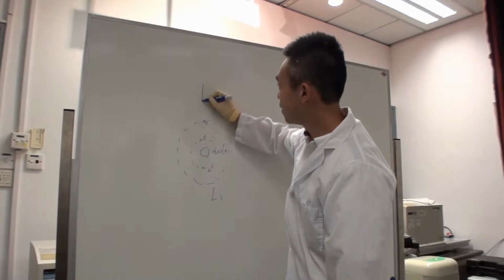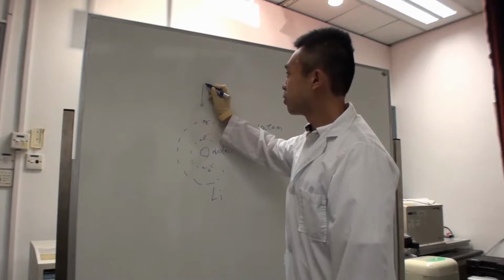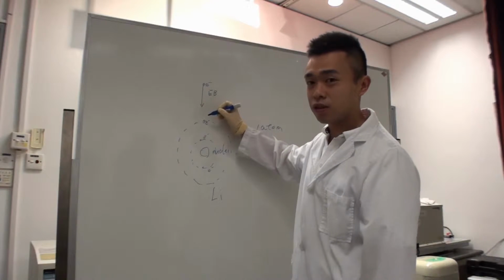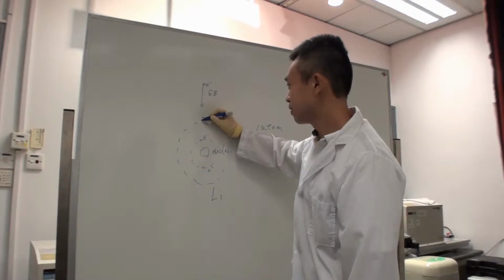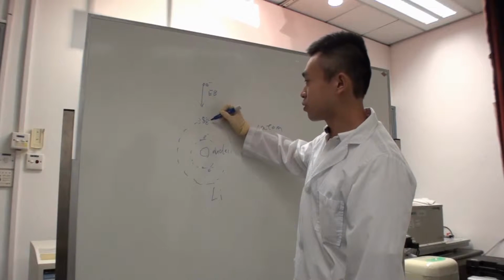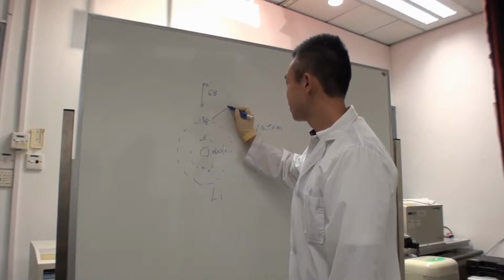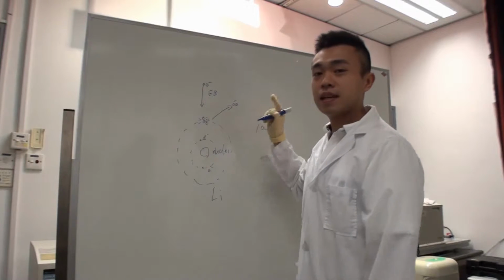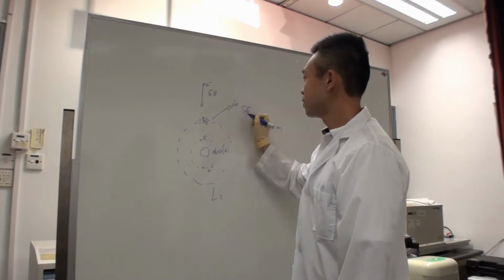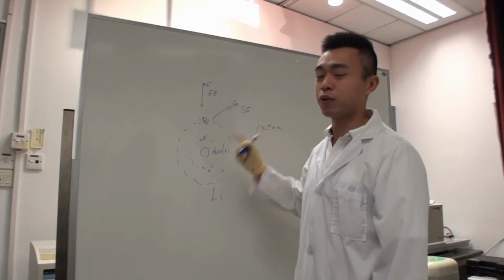And when the electron beam comes to this atom, an electron of the beam may collide with an extranuclear electron. Then the extranuclear electron will get energy from this collision and be emitted. This electron is called a secondary electron, formerly an extranuclear electron. And this is how the secondary electron is produced.